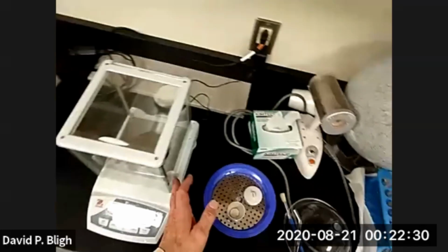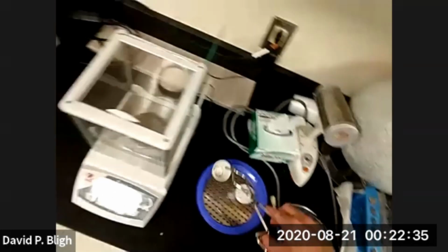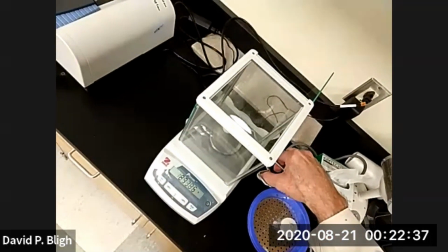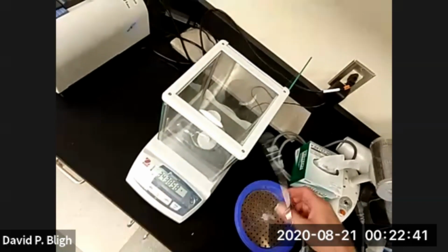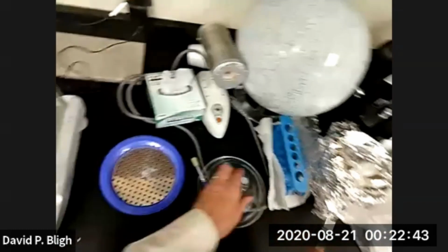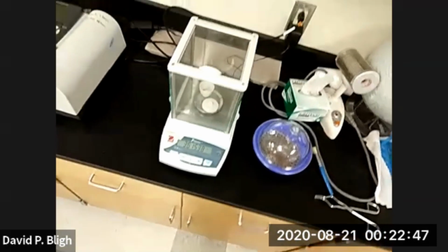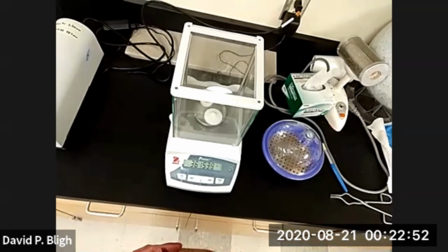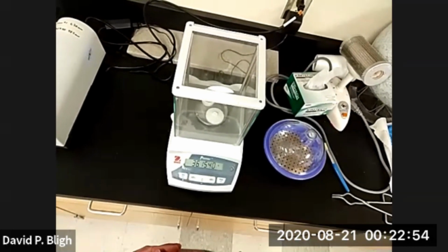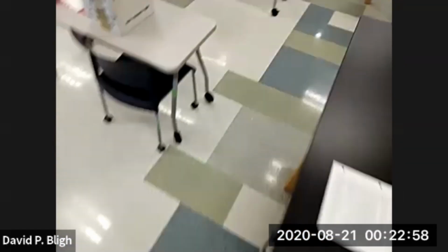So let's find out what the mass is for this product. Okay. 36.1, still drifting. 1540. 36, 1540.